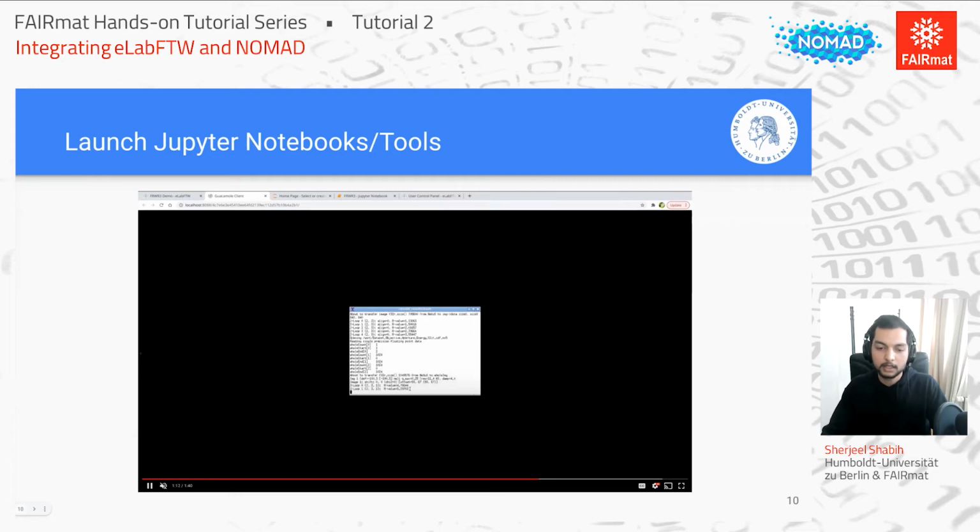And here you can see that the analysis can run directly on the server, which is much faster because the server is usually stronger. And also you don't have to sit and wait on your computer. You can just walk away, grab a coffee, and when you come back, your analysis would be done.